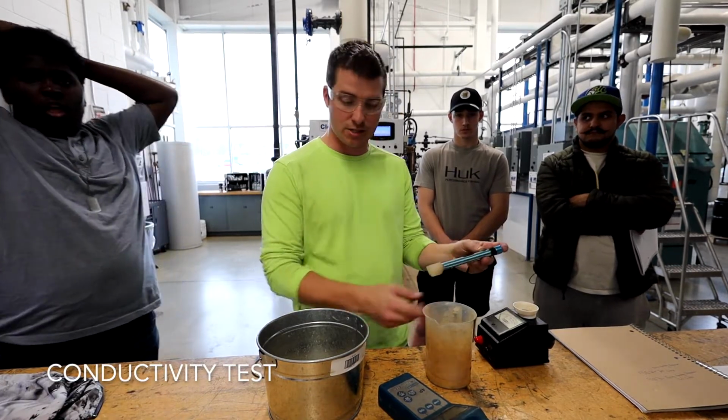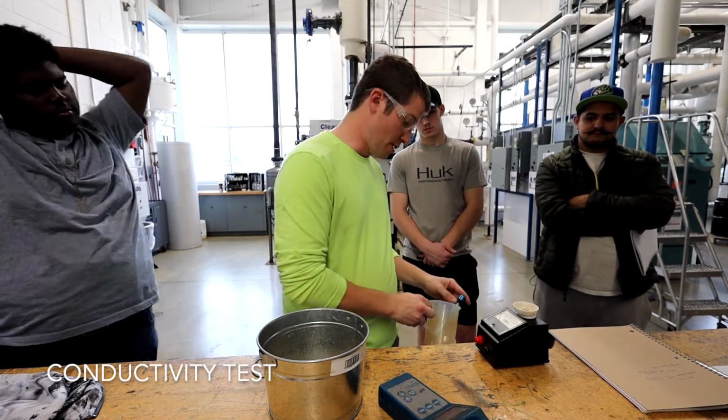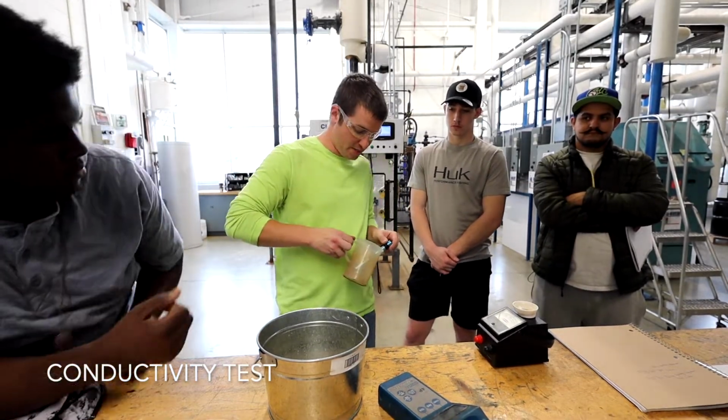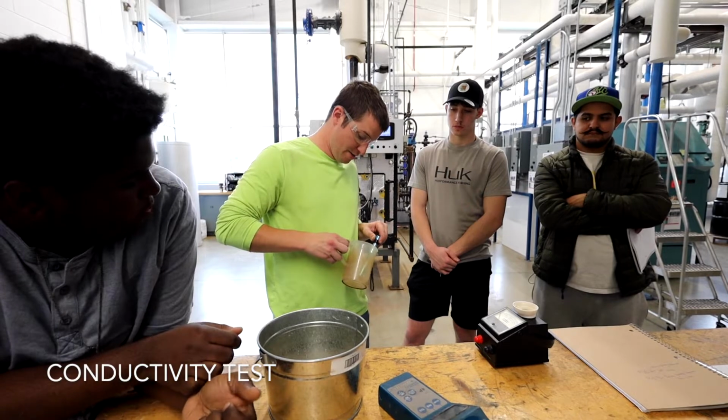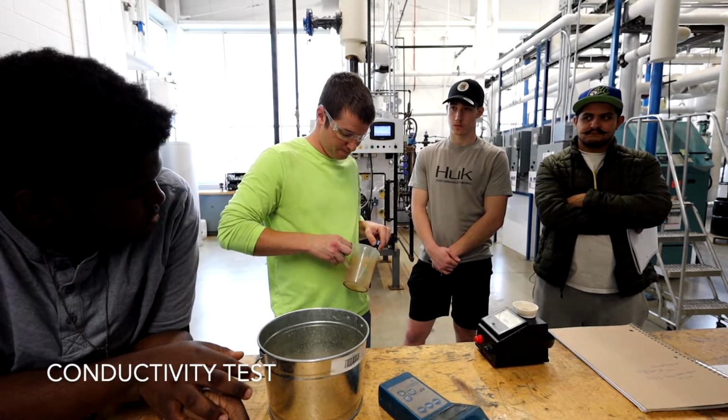So if you have one like this one's pretty simple. You just stick it in, you hit the button, right? It's turning on. It's gonna start blinking fast, and then we're gonna let it sit there, and then it's gonna start blinking slow, and once it's done, it's gonna spit out a reading for us.